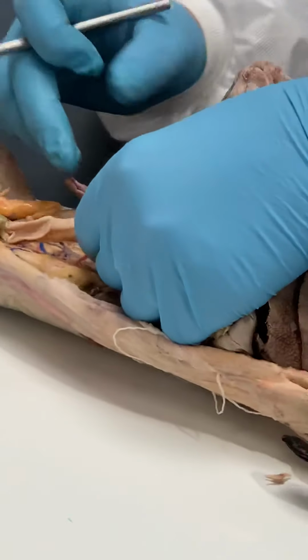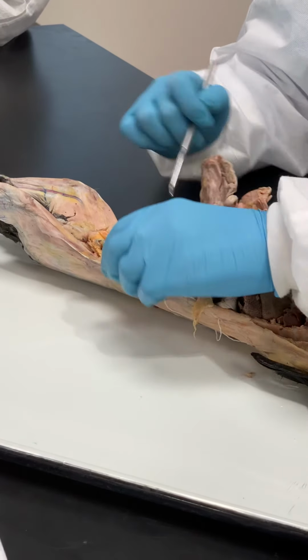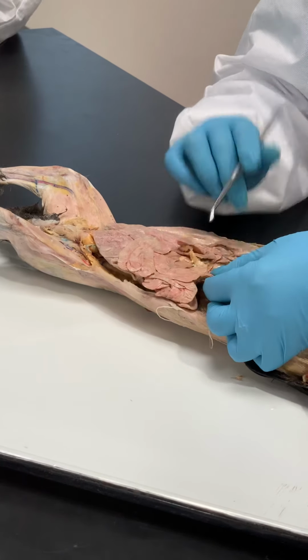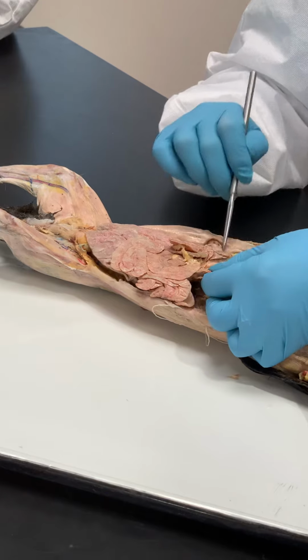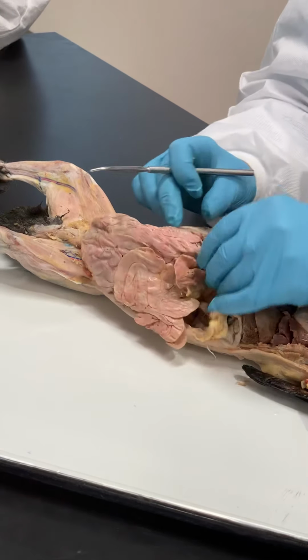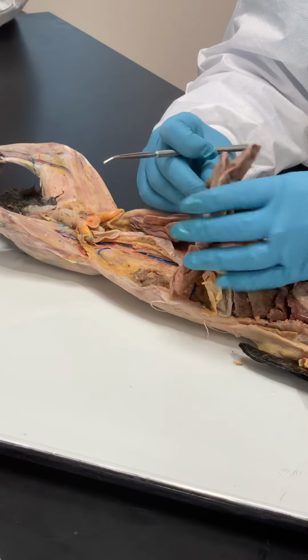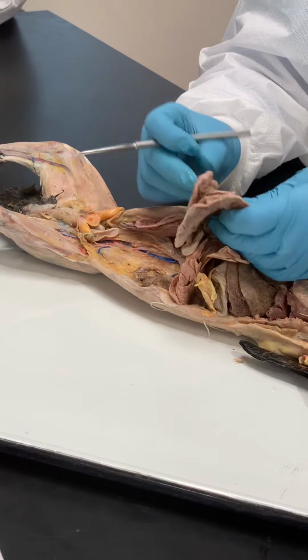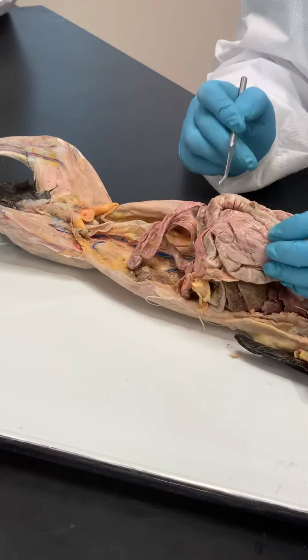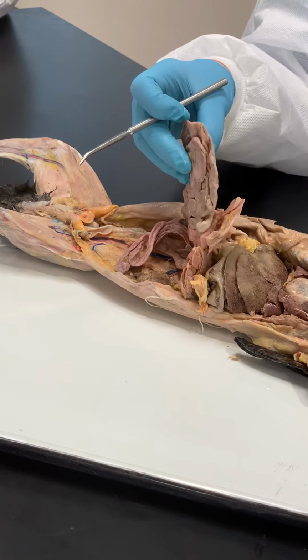Okay, these are all connected with membrane, connective tissue. So here's your large intestine. It's going to come around somewhere over here. Here's your small intestine coming off the stomach, coming around here. And right in here is the cecum. All of this big sac, this accordion looking thing. This is all cecum, enlarged for fermenting.